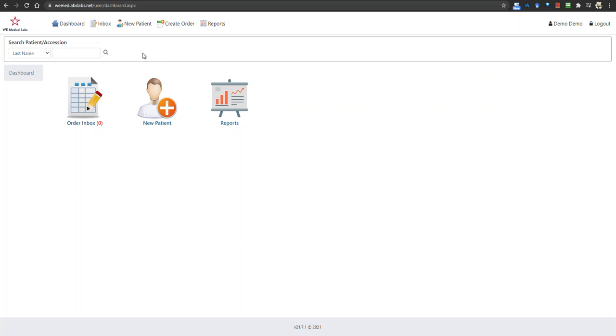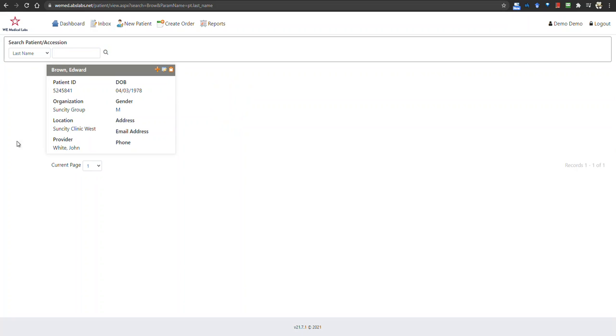Typically we do the query by last name, although we have multiple options. In this case we're going to be looking for patient Edward Brown. So using his last name, and then it's going to bring up the patient record.